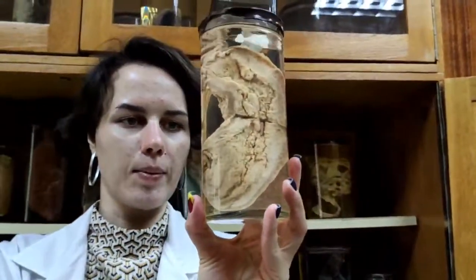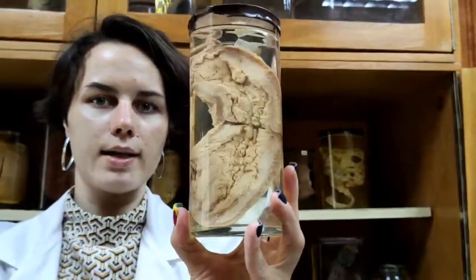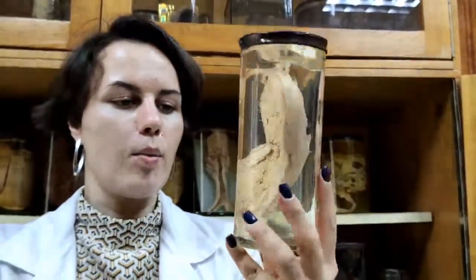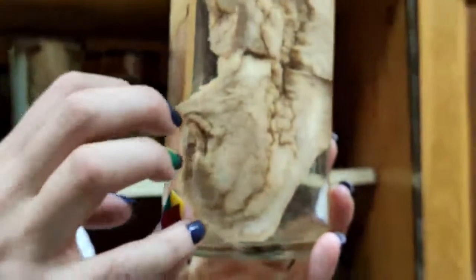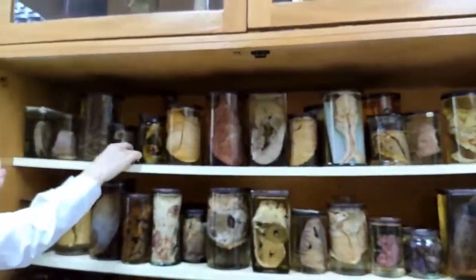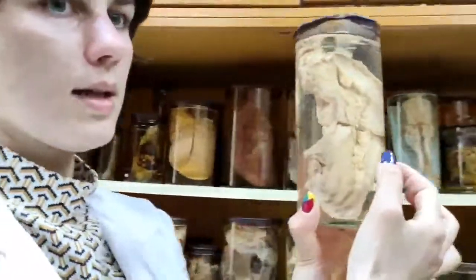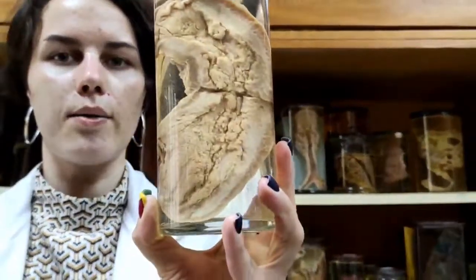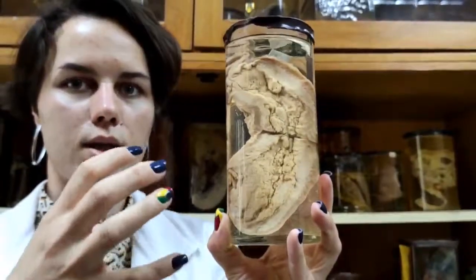The next condition, I guess, is stomach cancer. Here you can see stomach. Stomach has almost normal size in this case, and you can't see any endophytic or exophytic lesions here, but if you look attentively, you will see that the wall of the stomach is very thick. Very thick. I showed you erosions and ulcers. You can see, for example, here, that this is very thin normally, and here you can see that it's maybe 1 centimeter or something, because the wall of the stomach here is infiltrated by cancer cells.